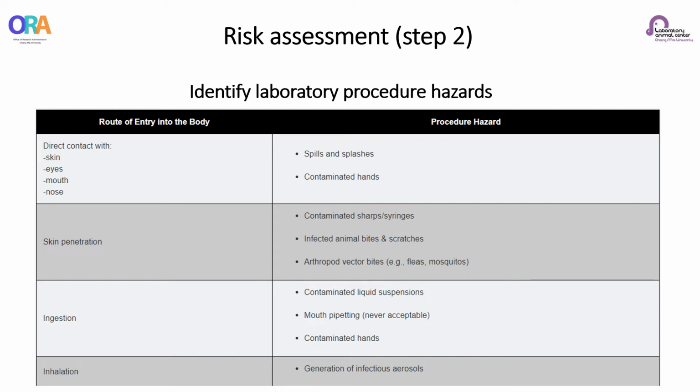And agents capable of transmitting disease through aerosol and droplet inhalation are a very serious laboratory hazard for all its occupants. They are usually undetected and extremely pervasive, placing the laboratory worker carrying out the procedure and other persons in the laboratory at risk of exposure.